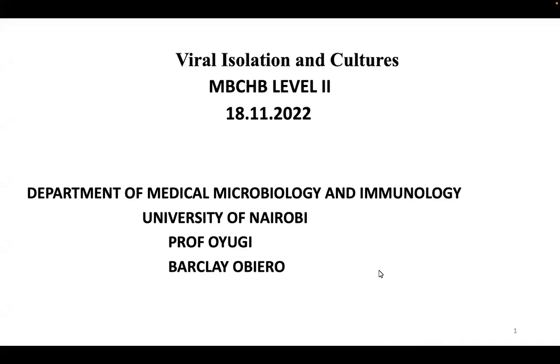And I think we'll take a shorter time today. We'll not take a long time. Probably within an hour, we should be done. So we'll be learning about viral isolation and cultures. So basically, cultivation of viruses.